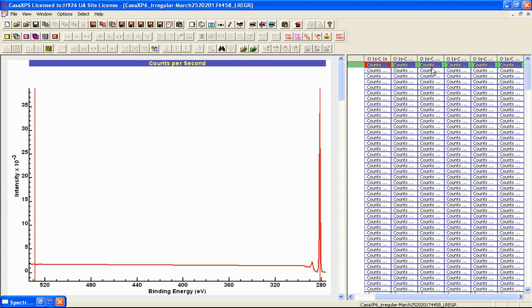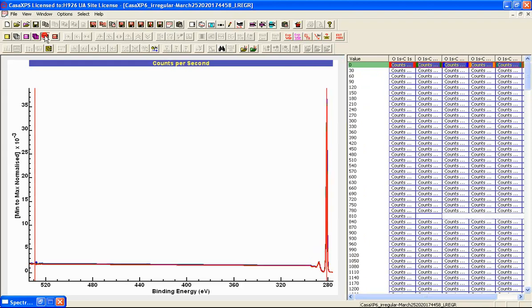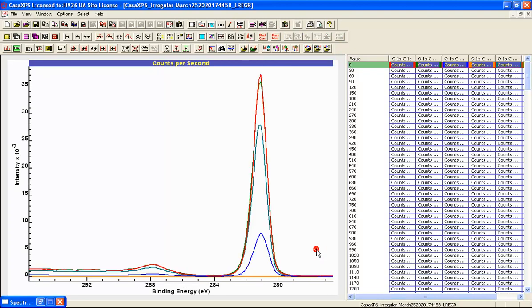There were four spectra in the active tile, and so we now have four columns corresponding to the least squares calculation, and I can overlay on a row by row basis, turning off the normalization, so that we can see what these data now look like when analyzed in terms of these four vectors instead of two.